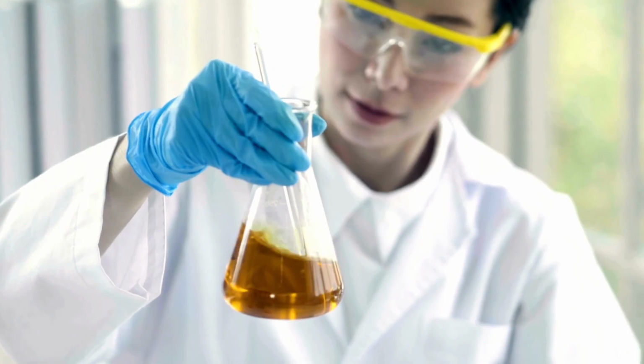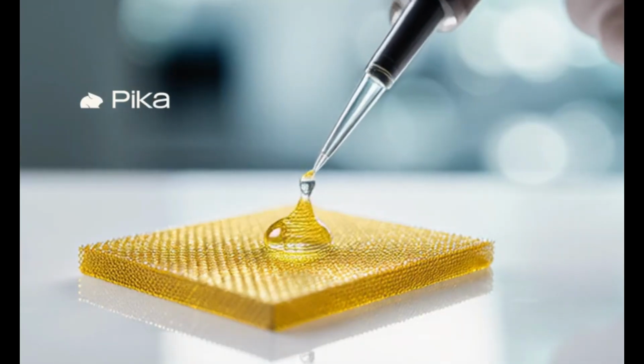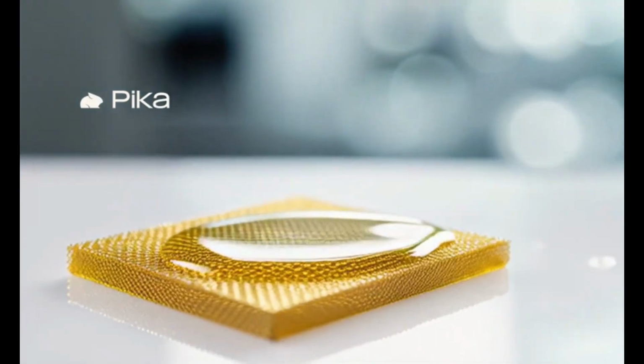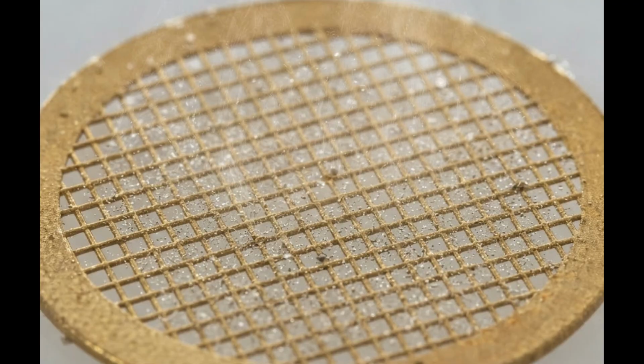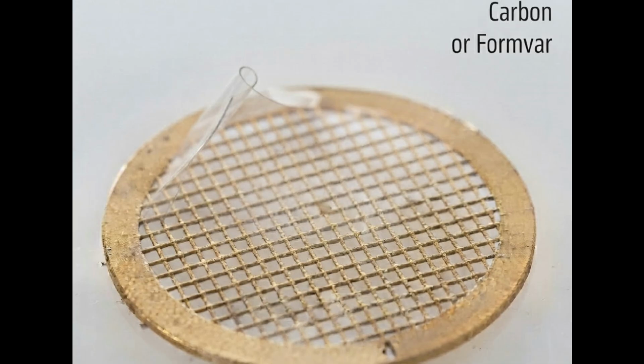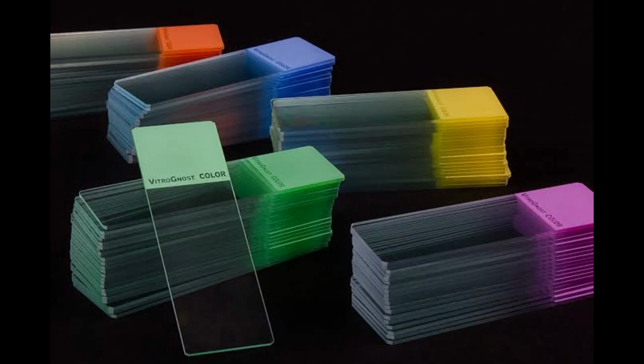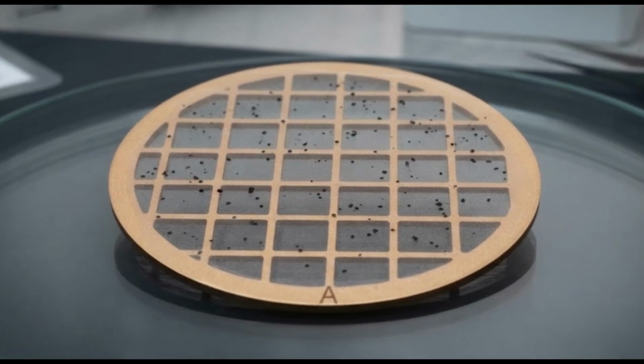When working with suspensions or powder samples for transmission electron microscopy, TEM, the sample must be deposited onto a substrate and dried. This is typically done using a TEM grid, a small, delicate metal mesh, roughly 3 millimeters in diameter. These grids are commonly made of copper, nickel, or gold, and are often coated with a thin layer of carbon or Formvar to support fine specimens, such as nanoparticles or biological sections. Simply put, the TEM grid acts as the microscope slide for TEM, providing a stable platform for your specimen.